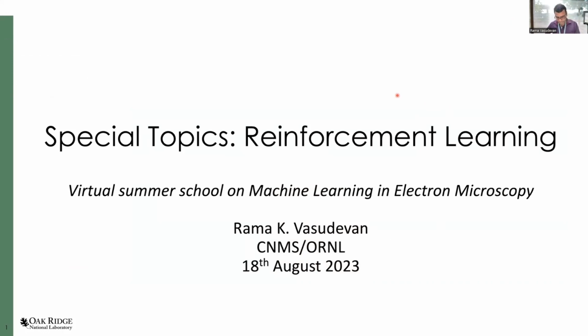I'm going to focus the last part on scanning probe microscopy. However, this is also equally applicable to electron microscopy, and it's in fact work that is currently being done as a collaboration between UTK, ORNL, and other partners.